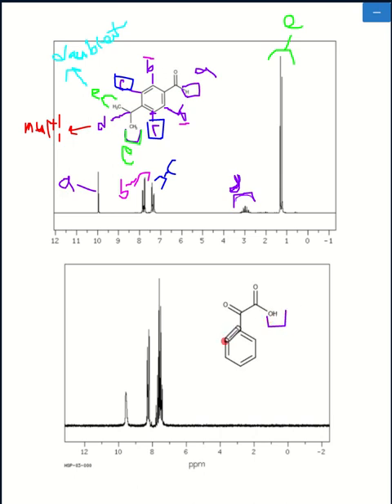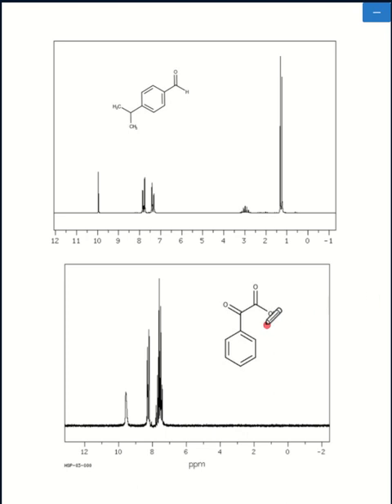That would show up. Therefore, we have 1 hydrogen right here as 1 unique hydrogen environment. We have hydrogen coming off of the carbons that are closest to this very long substituent. Therefore, based off of symmetry, they would show up as their own environment or their own group of peaks.